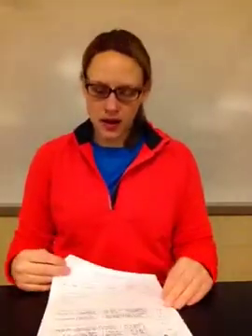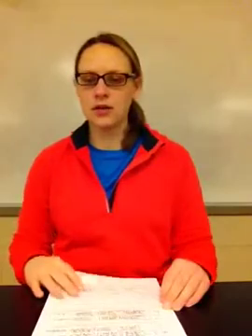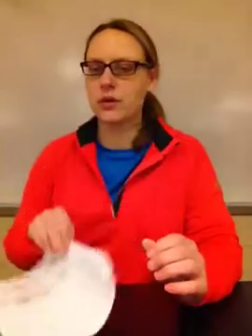When you mix these two, one of them is going to make a solid. And I gave you a solubility table to figure that out, and I will talk about that more in a little bit. Basically, the thing that's going to be produced is barium carbonate. So you're going to start with 2 grams, because that's how much you want, 2 grams of barium carbonate. You're going to convert it into grams of the 2 reactants. So you're going to convert it into grams of barium chloride dihydrate and into grams of potassium carbonate. So you figure out how many grams you are starting with.